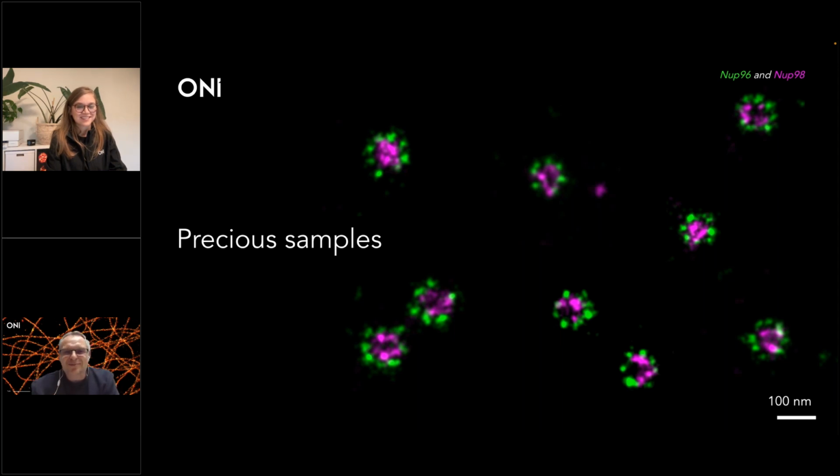STORM actually worked very well with that, but in a different high resolution technique, actually it was STED, we shone high laser power. What happened? The cells just burst. They burst because they were basically black. They absorbed all the light, all the water inside the cell, and it just burst. So please watch out what you're imaging, because at some point you may get this really strong absorption of light inside the cells and just get them bursting. It was an interesting observation because I never saw anything like this before. So I would say watch out for it.